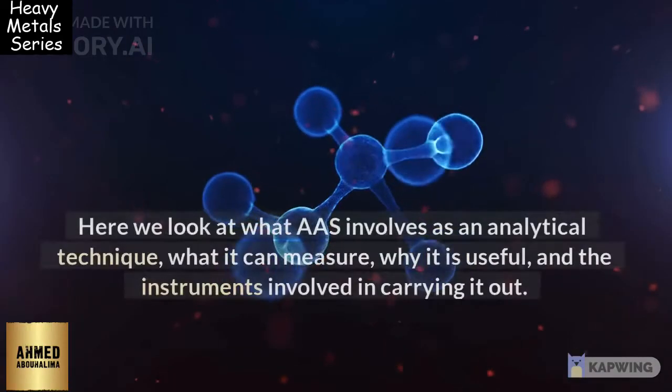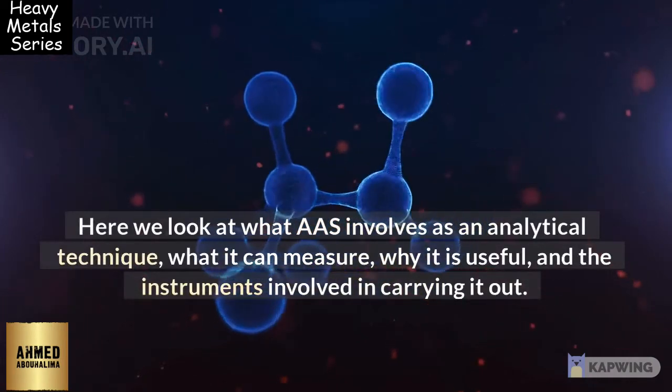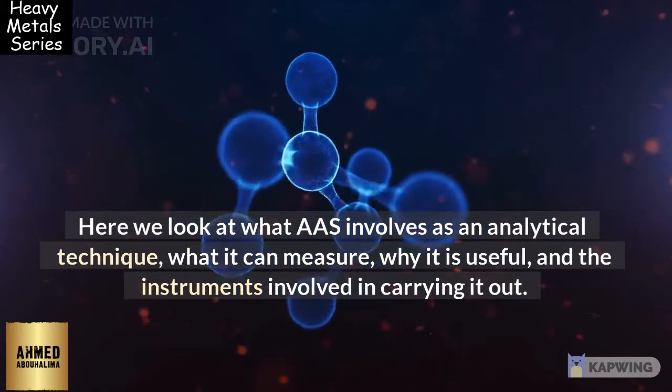tested. Here we look at what AAS involves as an analytical technique, what it can measure, why it is useful, and the instruments involved in carrying it out.